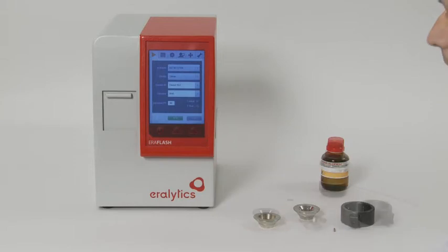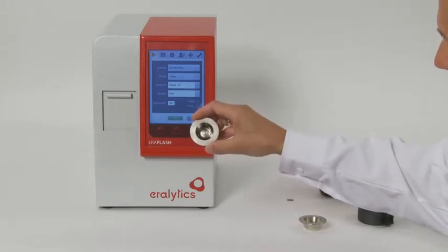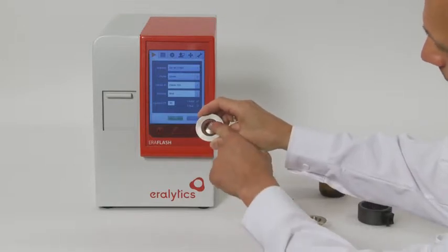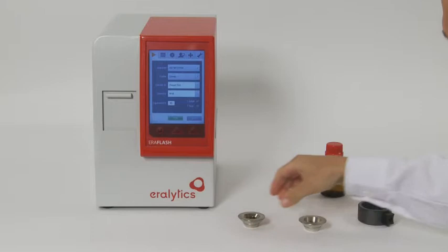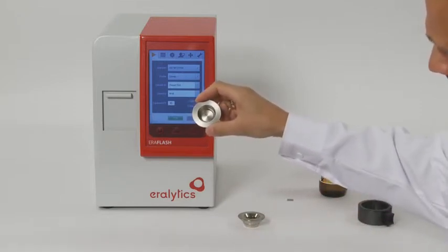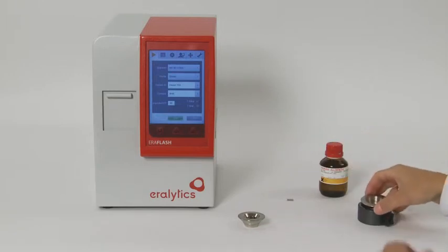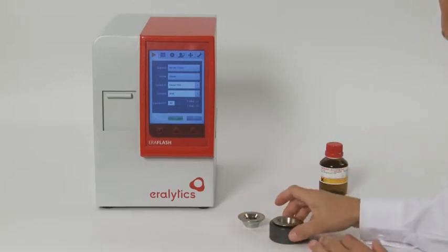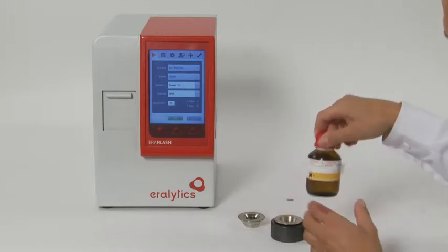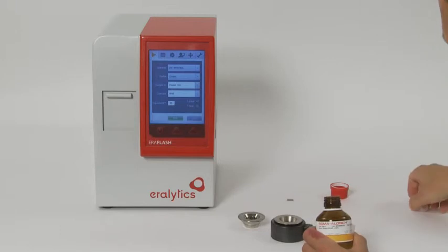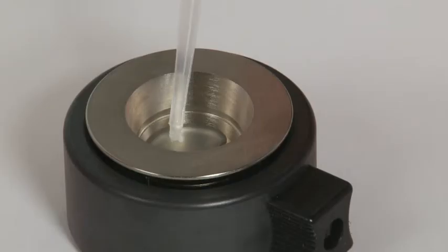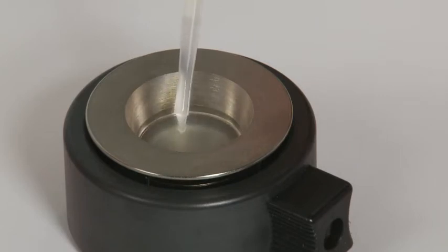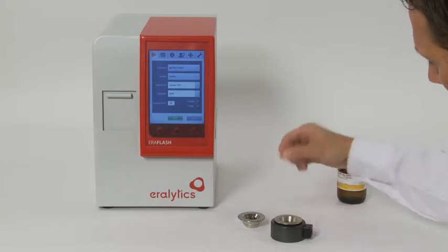There are two different sample cups delivered with the Eralytics Flash: a one milliliter sample cup for ASTM D6450 measurements and a two milliliter sample cup for ASTM D7094 measurements and for all correlation methods. Put the respective sample cup into the insulated sample cup holder. With a pipette, fill the sample cup to the mark, then add the stirring magnet.